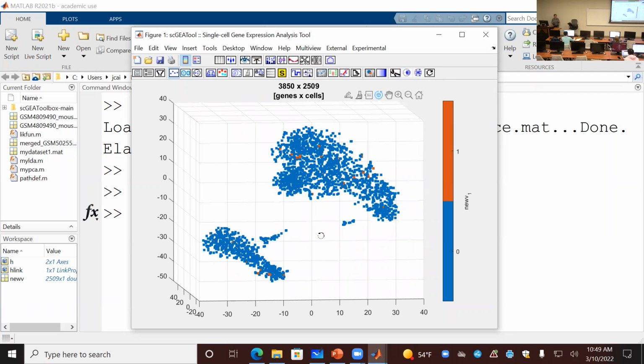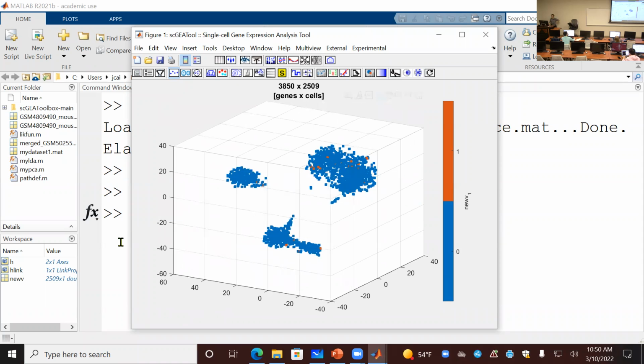So that's the way if you have an external variable vector, you can read that in and color code your cells. So what you need to do is, for your cells, put zeros first as a background, then start to add those clonal types for T cells, and then use another code for clonal types for B cells. In this sample, you have both T cells and B cells. Okay, I hope you get the idea.